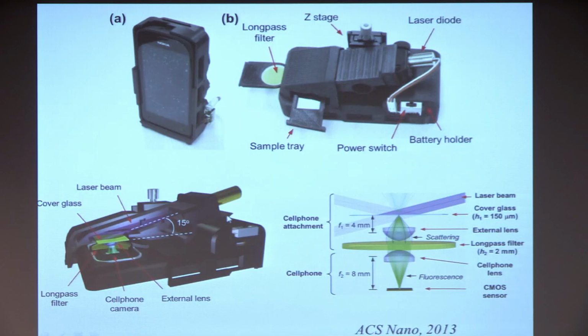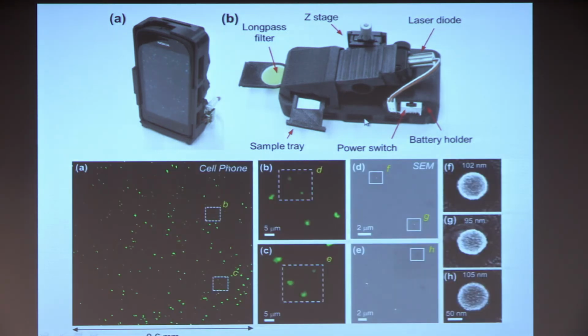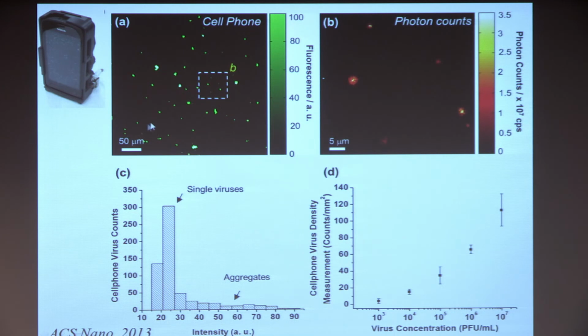In this case, you're looking at a dark field and fluorescence microscope, also 3D printed, which has sensitivity to see viruses and nanoparticles, sub-100 nanometer particles, very nicely matching traditional light microscopes in terms of sensitivity. This is a great example where we're comparing our cell phone image, where these green dots are individual viruses, human cytomegaloviruses. These are viruses that have surface proteins, glycoproteins, that are labeled with fluorophores. Maybe 500 to 1,000 fluorophores per spherical virus particle. That's what is imaged per particle per virus in this cell phone design. And now our comparison is a confocal microscope to really validate that we can image individual viruses. This can be a great way of measuring viral load in a complex specimen by different surface chemistries.